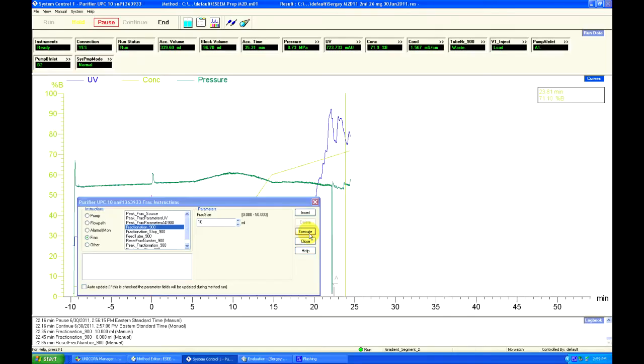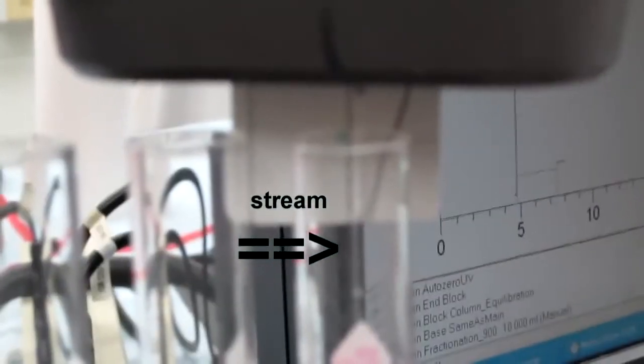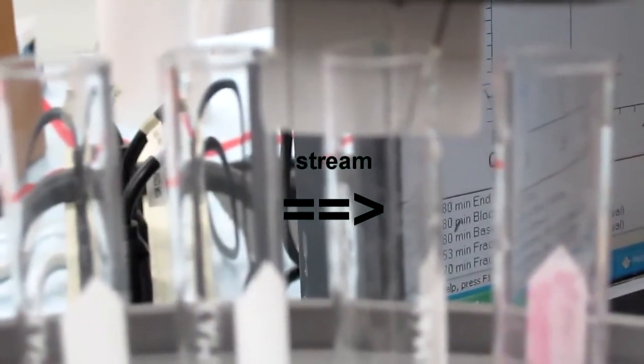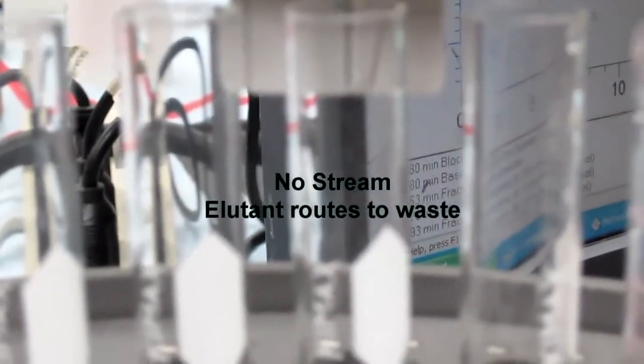This is how the fraction collector operates. After inputting a number into the message box and pressing Enter or Execute, the fraction collector will attempt to collect that volume of sample. Hitting Enter again while there is a number in the message box will signal the fraction collector to switch to the next test tube. Inserting a 0 in the message box will stop collection and reroute the eluent back into the waste.